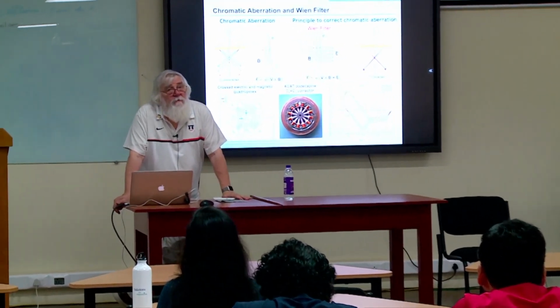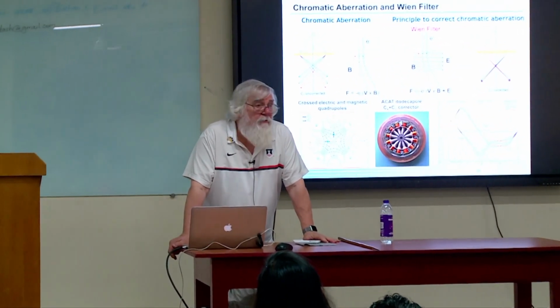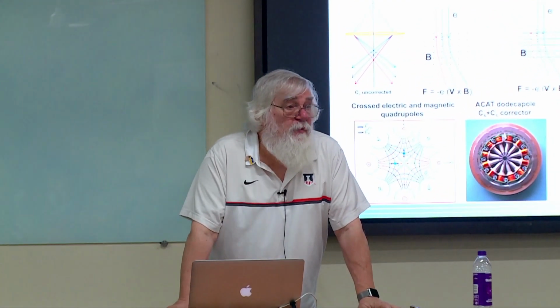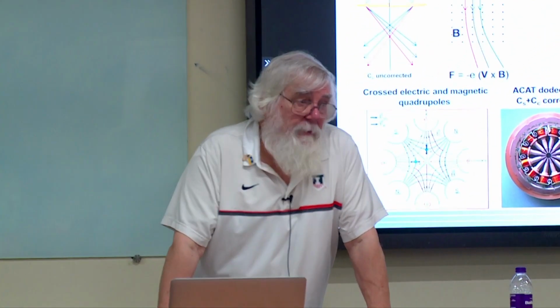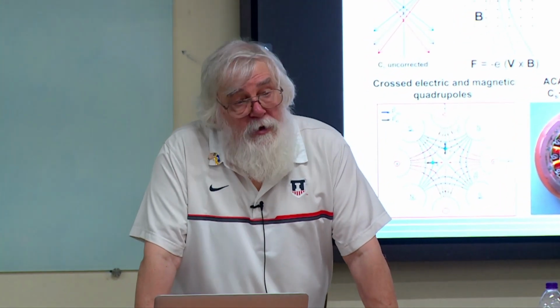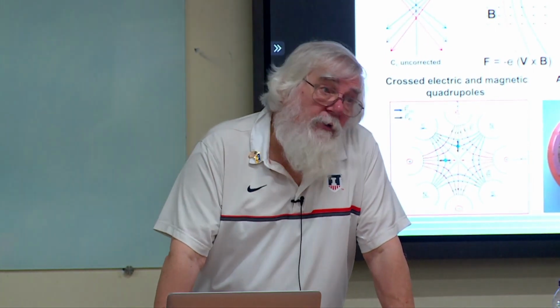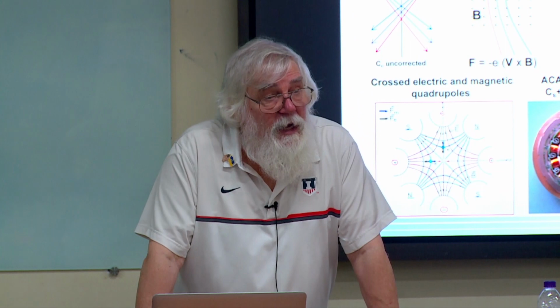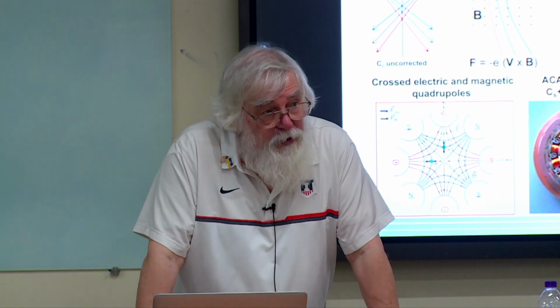And for high-resolution imaging, will it improve it a little bit? Yes. The spherical aberration corrector would be better. Okay? Now, a monochromator in your probe forming system will give you other opportunities. So there are other things you can do with a monochromator that would be beneficial.